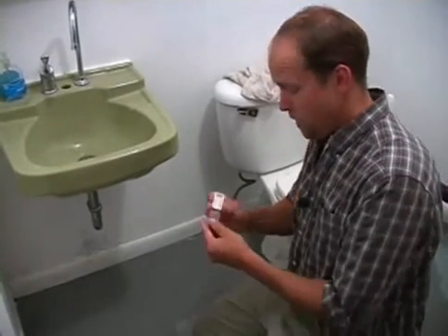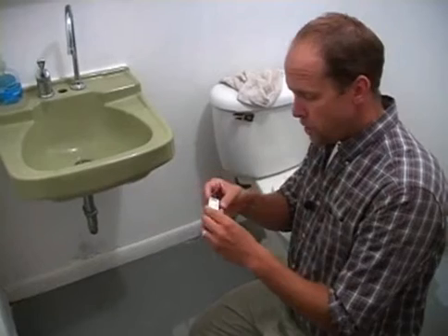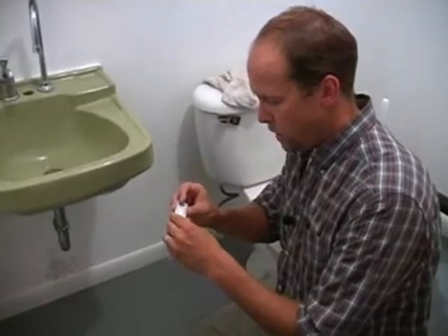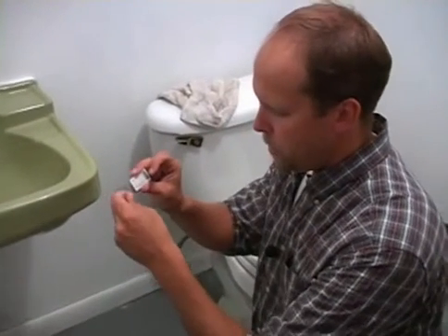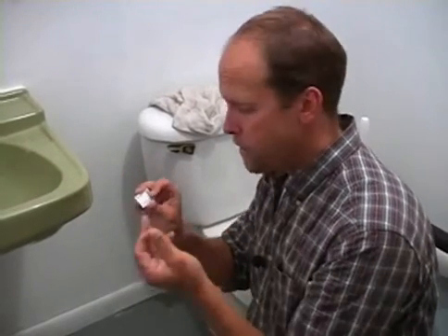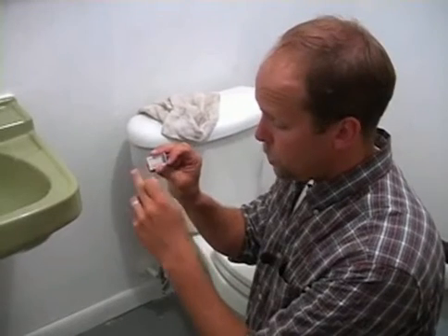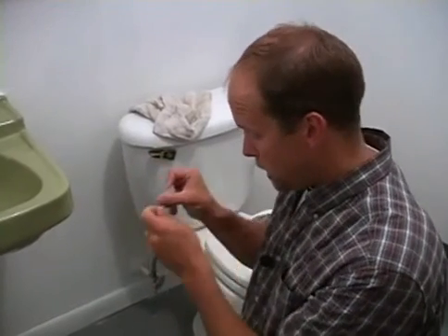I'm going to take a surface sample using BioTape. It's very easy to use, has a barcode, which is really nice, has an expiration date, tells you when you should not use this sampling device anymore. They have a little piece of plastic you peel off and you retain it, and those two lines show where you take that surface sampling. And I'm going to take the surface sampling down below the sink.